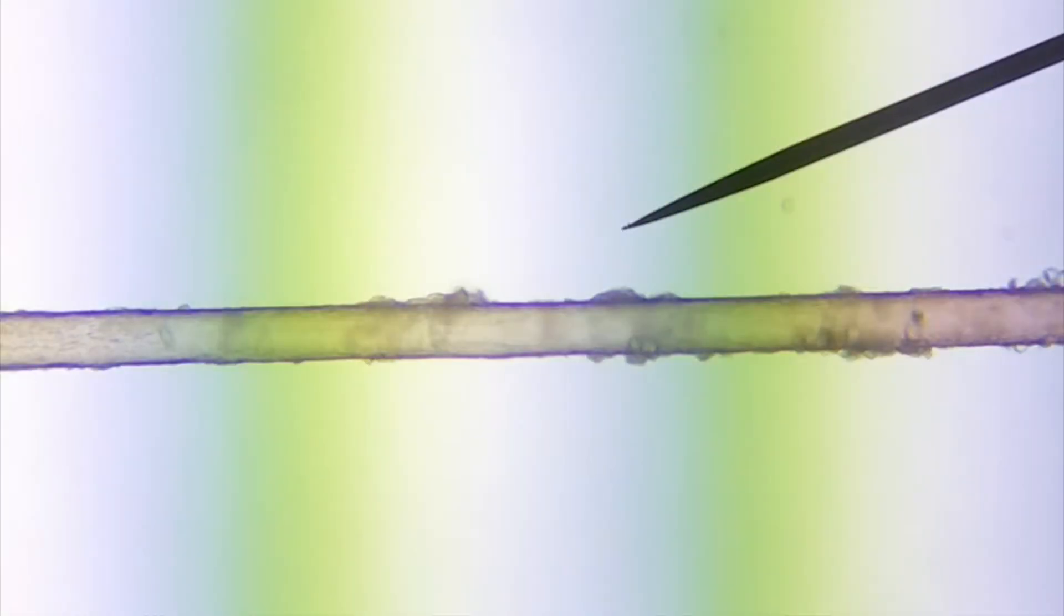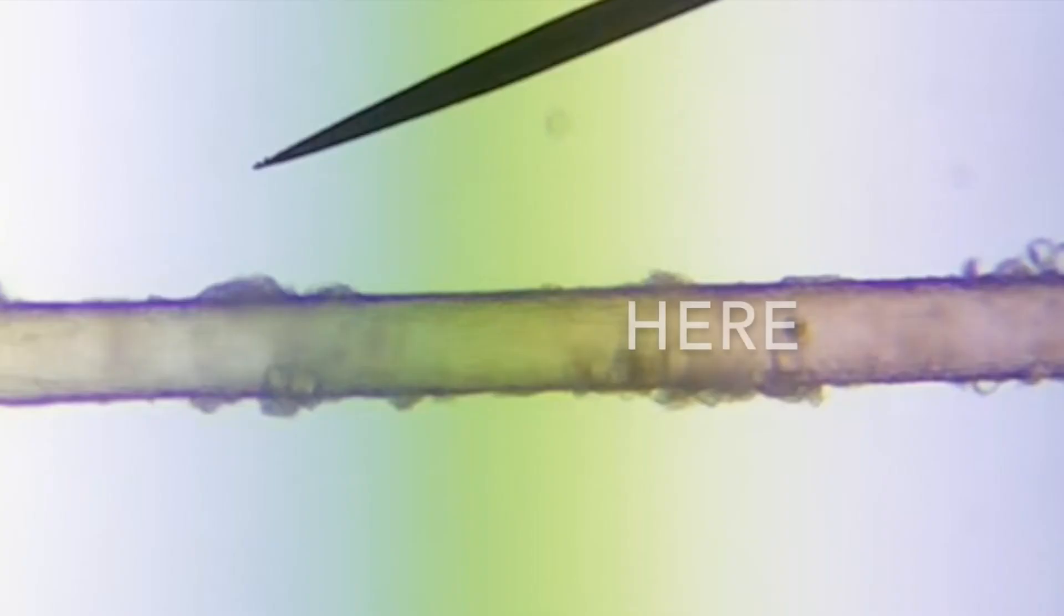Then this is actually really interesting because you can see the line of demarcation on this strand. So I've indicated the line of demarcation here and that's where you can just see where I last bleached my hair and deposited purple pigment just because of the difference in the two tones.